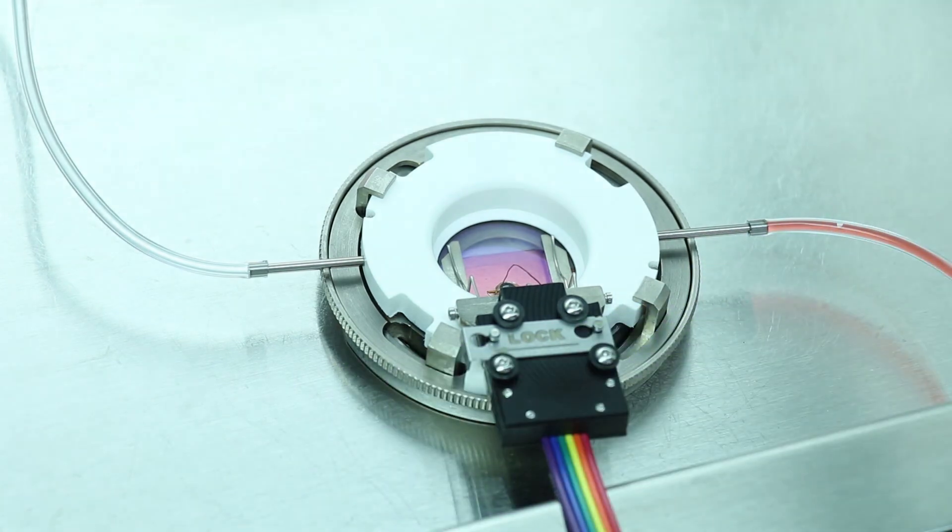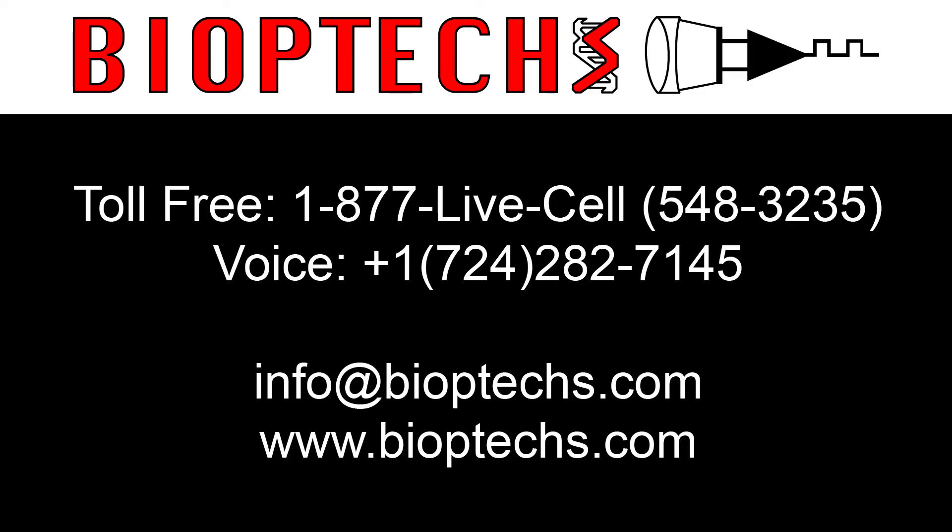The FCS2 chamber is now ready to load into a stage adapter, then onto a microscope for imaging.